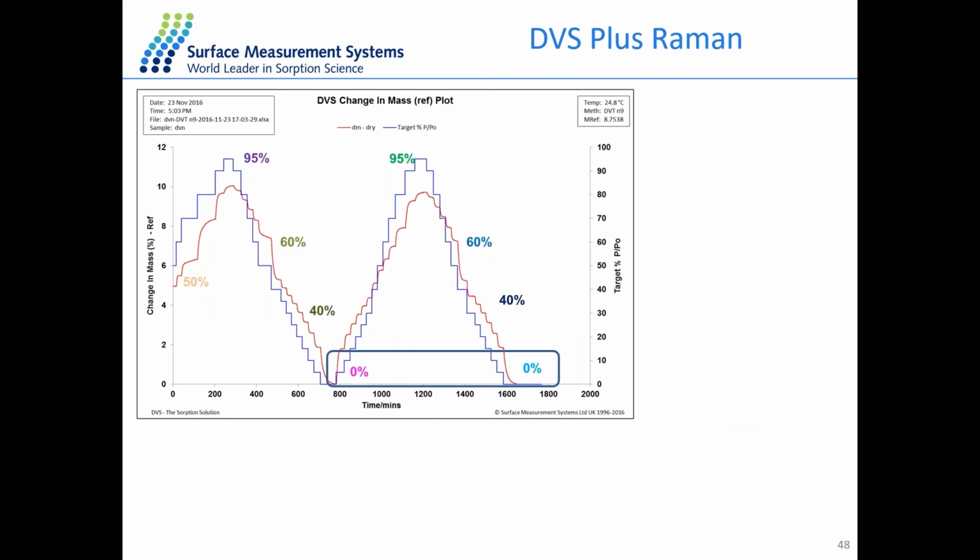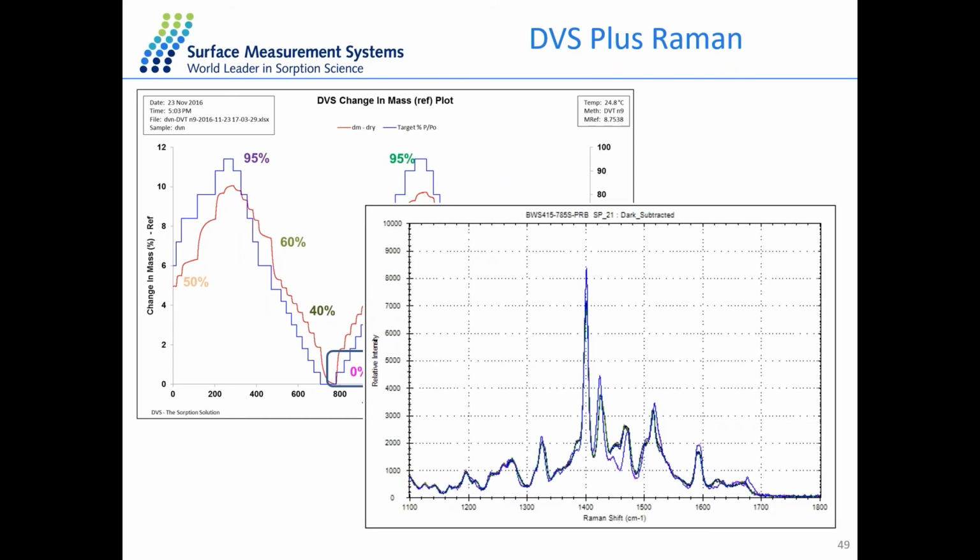However, when we look at the data at the end of the dry stage of the sample, the Raman data highlights immediately that there are different positions of the peaks, new peak formation, and a shift in the position of the original peak. Now, this is particularly interesting for the customer that we perform this experiment for, because the customer can immediately understand if the sample is perfectly dry or if it contains any residue of water.